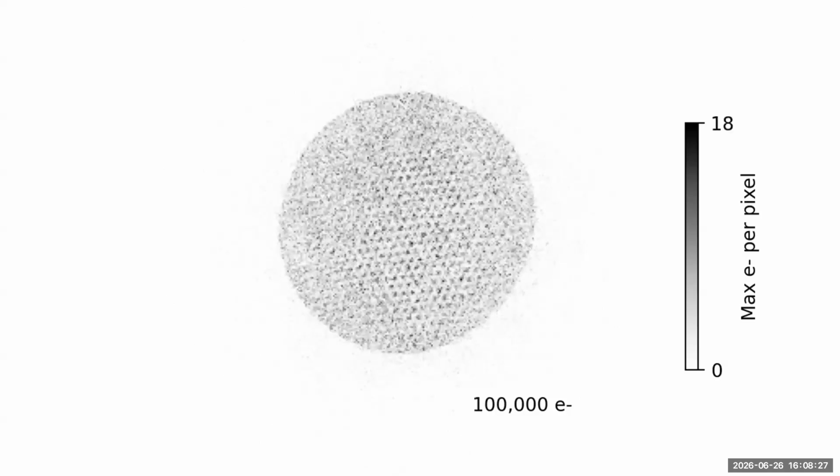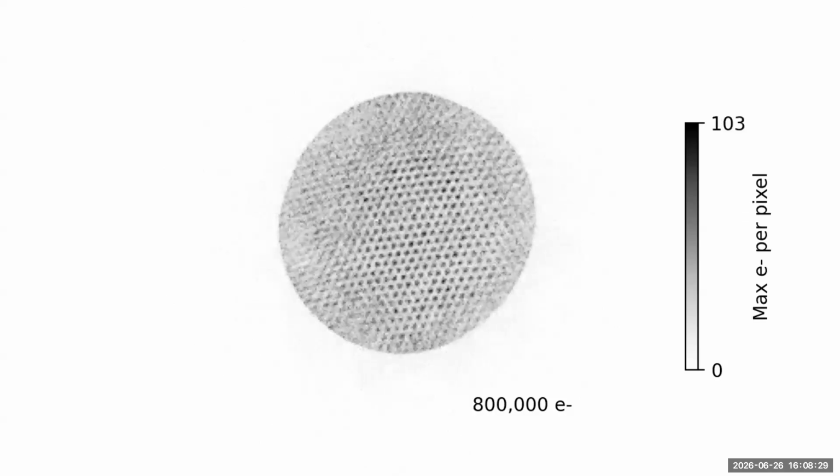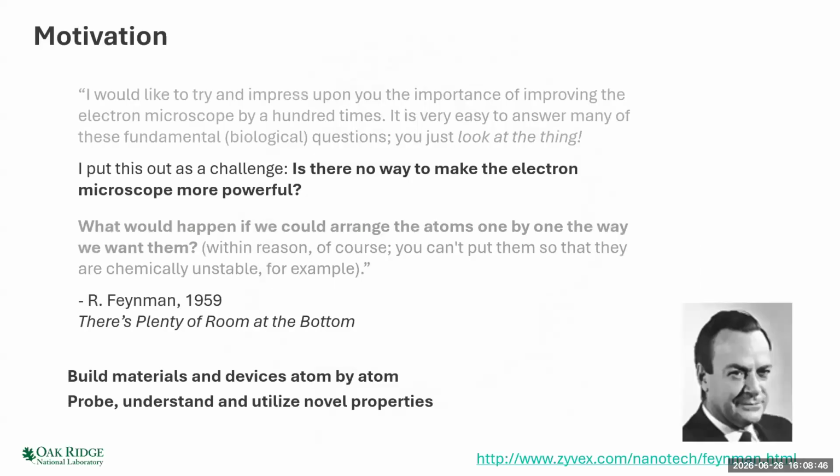So the point I'm sort of laboring here is really this is the Young slit type of experiment where you can see that you have an image which at the end you can only really explain by thinking about it as a sort of wave optical approach, and you see how it's being built up single electron by electron from discrete particles. So I'm going to talk a bit about how we got there.